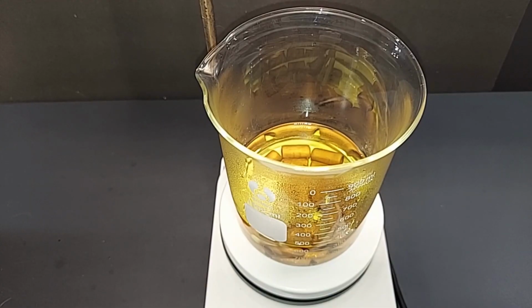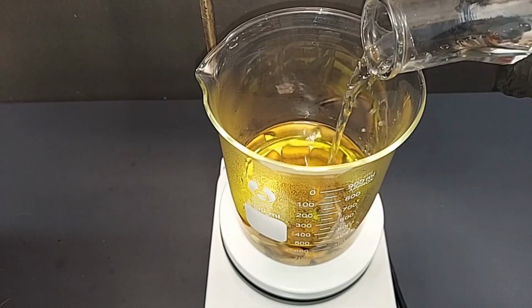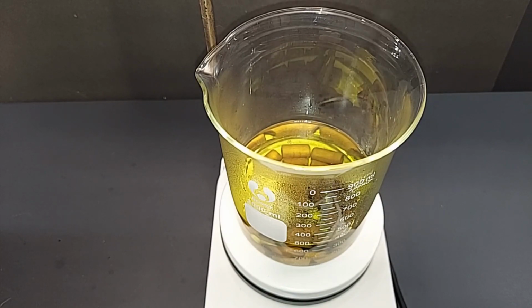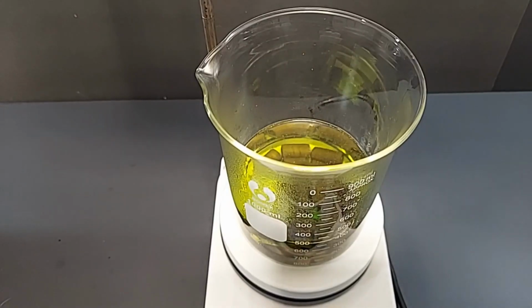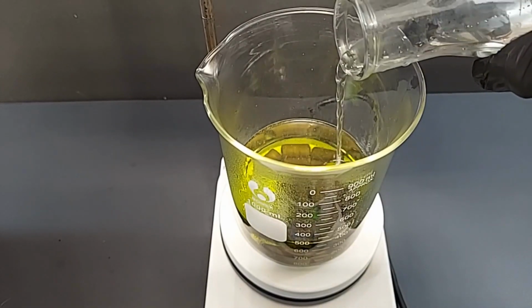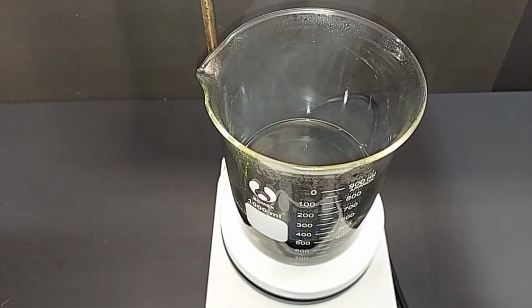One of the reasons I used a 1 liter beaker is because adding hydrogen peroxide will sometimes bubble quite a bit, especially when the solution is heated like this. So let's go ahead and start. I'm going to just add little amounts at a time. Okay, I'm adding just a little bit more here, and then we'll watch it for a bit. It's calmed down a lot. Obviously, it's still fuming quite a bit, so you need a fume hood to do this for sure. I'll periodically be adding the hydrogen peroxide. I'll be back when more of the copper is dissolved.